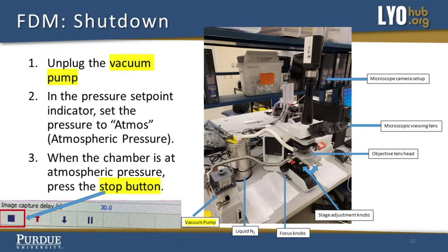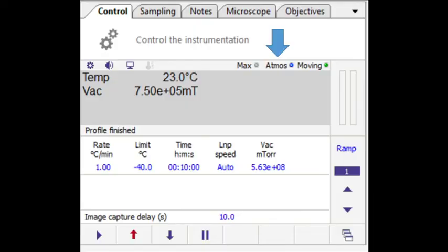In the pressure set point indicator, set the pressure to atmos, atmospheric pressure. When the chamber is at atmospheric pressure, press the stop button to end the data acquisition. Data and video may be exported by right clicking on the generated plots.